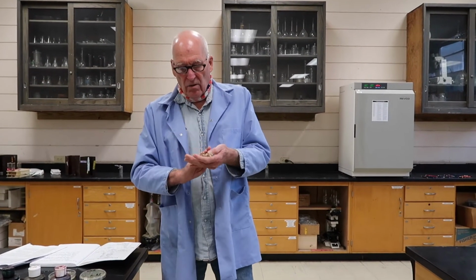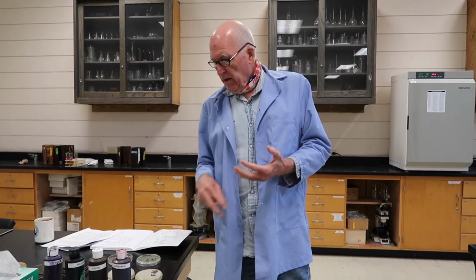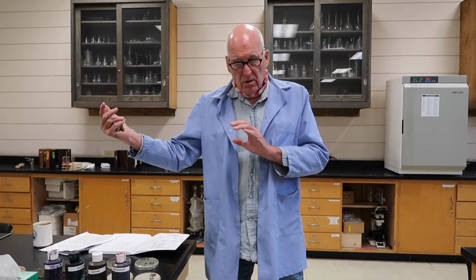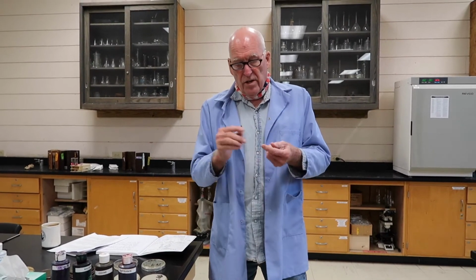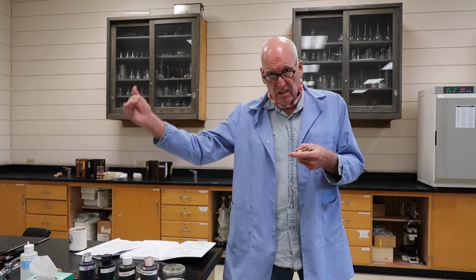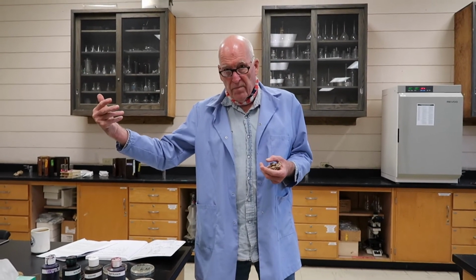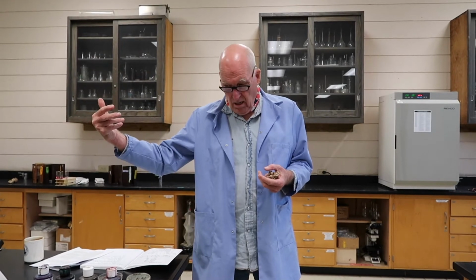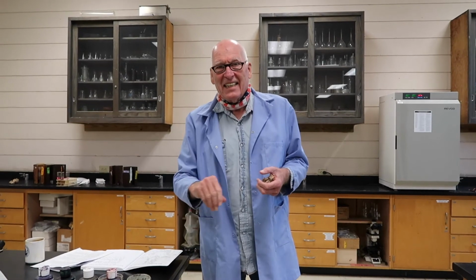And we're going to have a lecture on environmental tolerances so you can learn what governs how fast something grows. So in this case, we're getting large numbers. In fact, it looks like sauerkraut's done, because here's two measurements we use to do it. We use pH as a guide for how much acid is produced, and total acid. We're already up to 4% total lactic acid, and that means it's done. So we're finished with this one now.